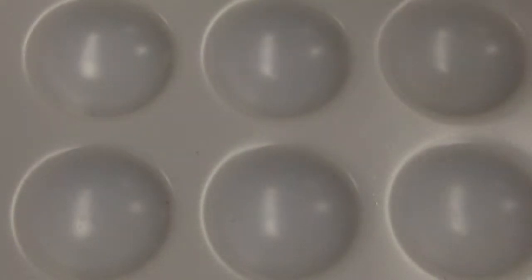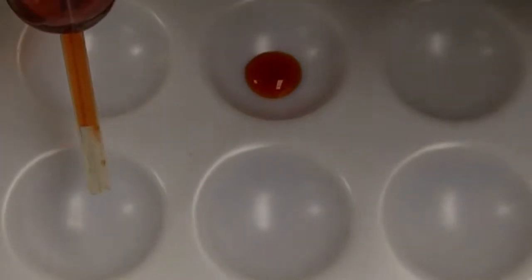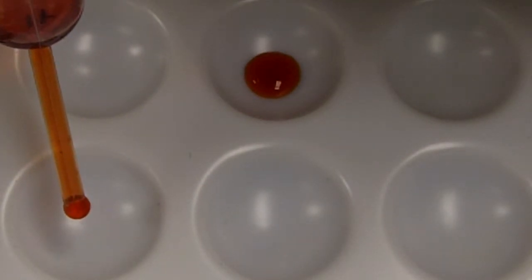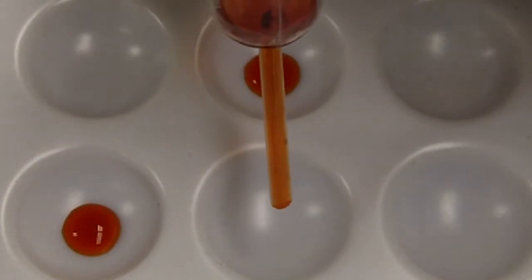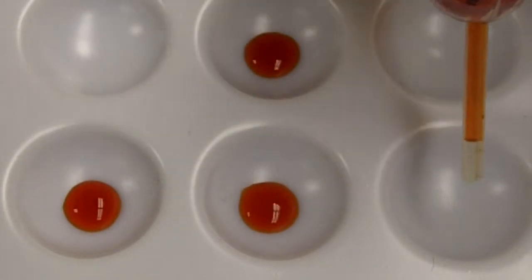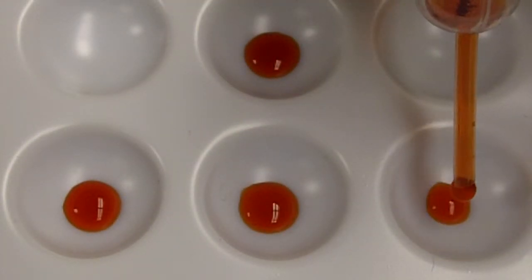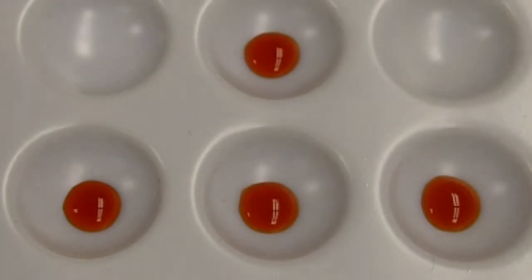Right now I'm going to place the stock solution, 2 drops of stock solution, in 4 different wells. The one there I just did first, that will act as our color control. So we have a comparison of the after color for each of these 3 on the bottom to the color of the original stock solution, which is of course right here.